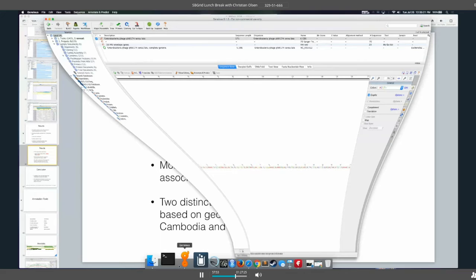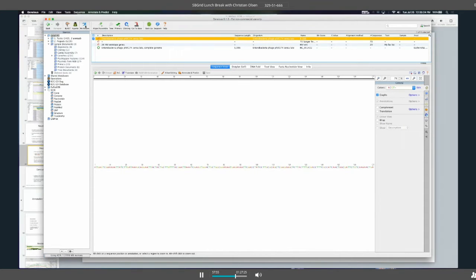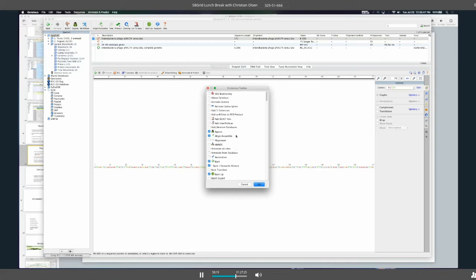Okay. So the workflow, if you had noticed in Geneious, you may have noticed the workflow icon at the top of the toolbar. If you have Geneious installed, you probably won't see that. And that's because you need to add it to the toolbar. So you'll simply right-click on the toolbar, and a little shortcut menu will pop up. Okay, and this will allow you to customize your toolbar. Okay, perhaps you don't do any cloning or any primer design. You can hide those icons. Or if you'd like to add the workflow icon, you just choose Customize, and at the very bottom, select Workflows.